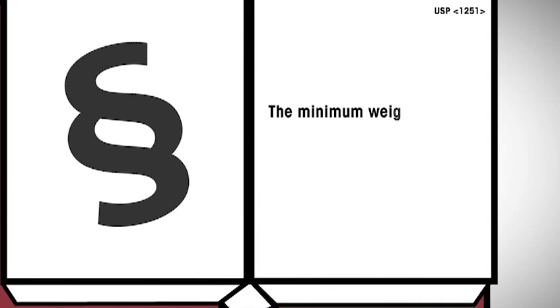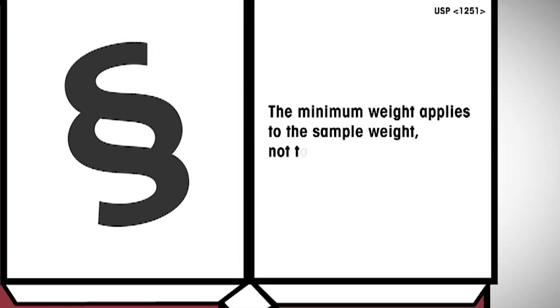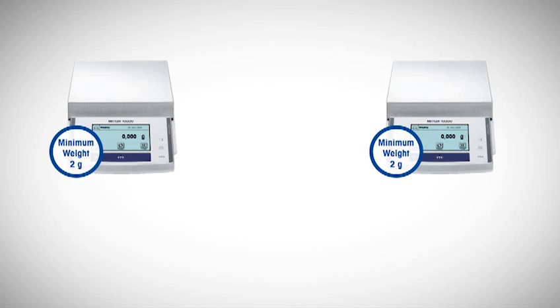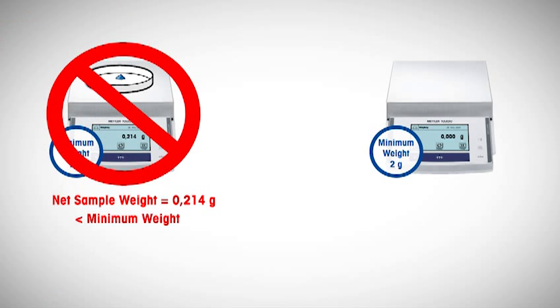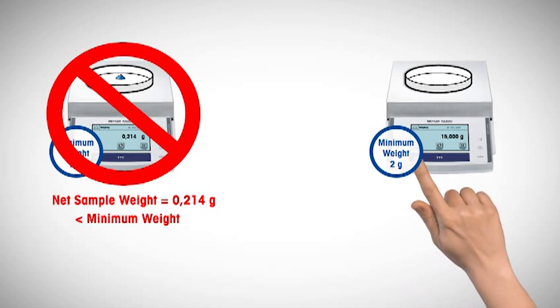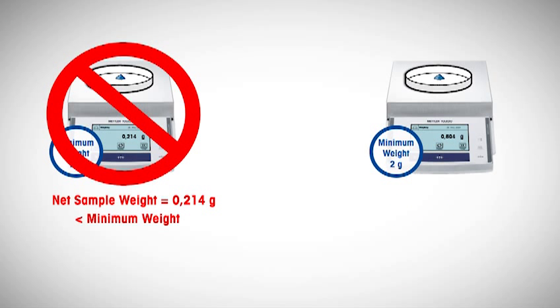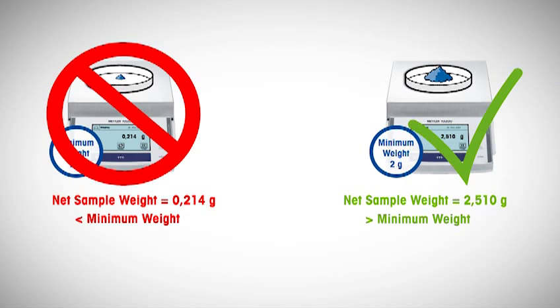The minimum weight applies to the sample weight, not to the tare or gross weight. A common misconception is that if the tare vessel is larger than the minimum weight, the weighing process is in compliance. It is now clearly stated that the net sample weight must be considered, not the gross weight.